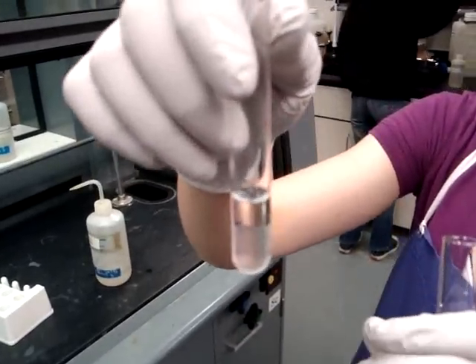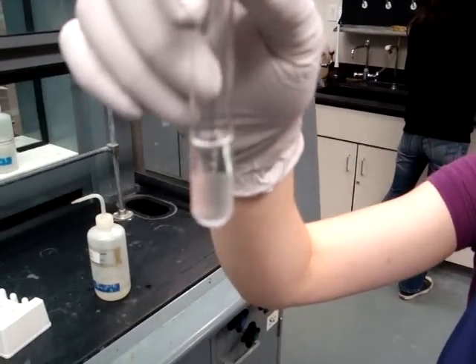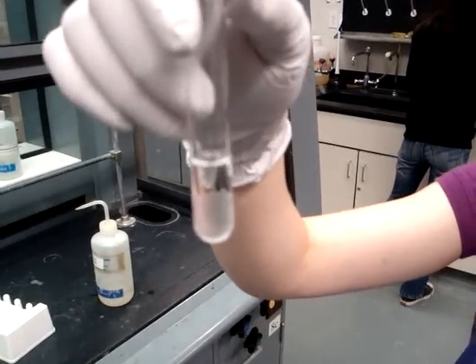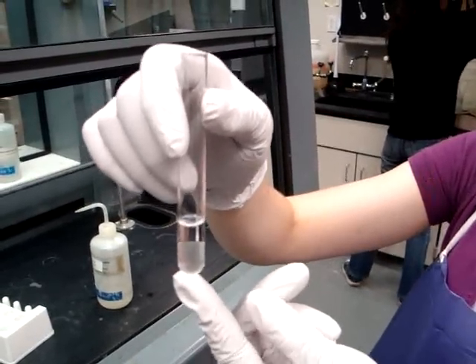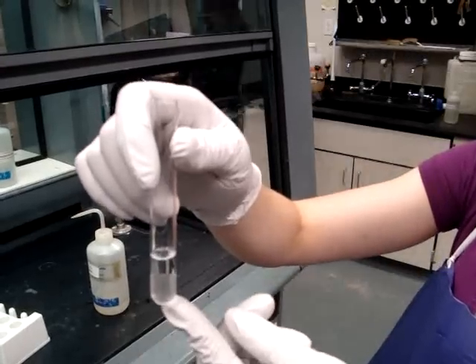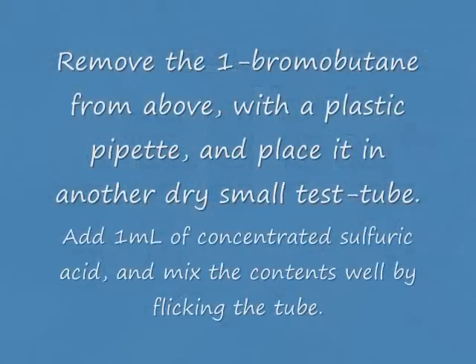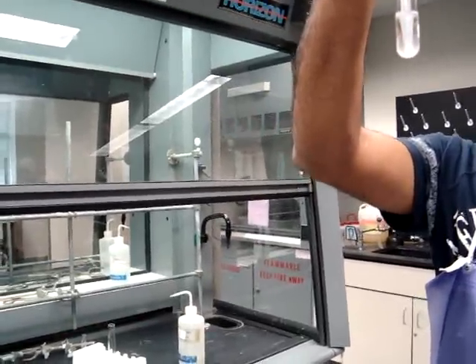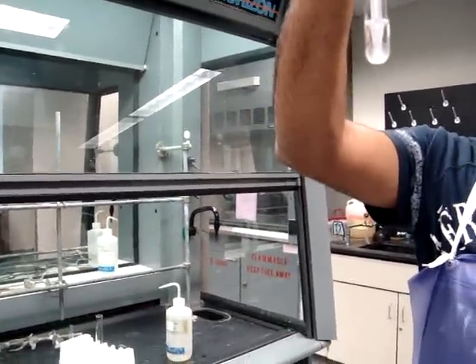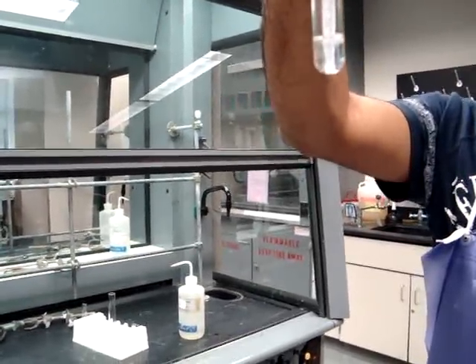As you can see, two layers will form. The bottom layer contains your 1-bromobutane, which you will be removing from this tube and placing into another test tube. When you have just the 1-bromobutane solution, you will then be adding one milliliter of concentrated sulfuric acid in order to remove impurities. You will then use a pipette to remove the bottom layer of the small test tube and place it into another small test tube where you will add your concentrated sulfuric acid.